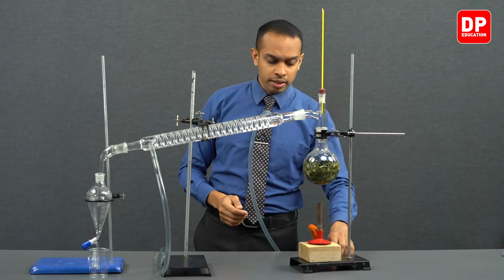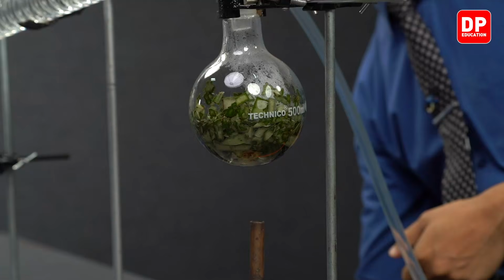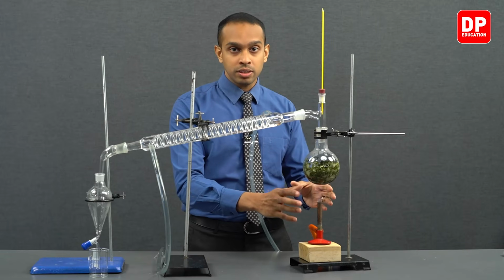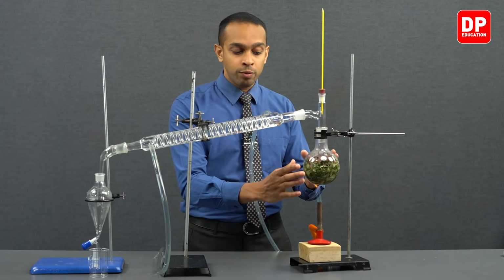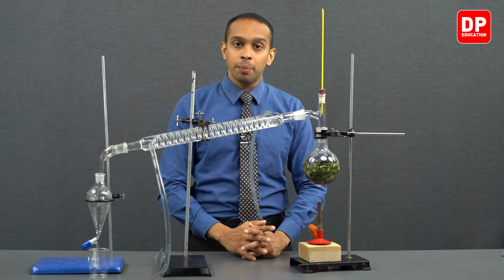Now let's turn on the Bunsen burner. Now students, after lighting the Bunsen burner, you will see that the Bunsen burner will provide heat to this round bottom flask, and the water in the round bottom flask is going to heat up.